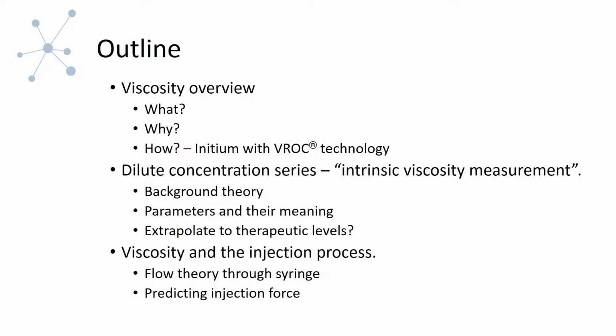viscosity and relate it to the injection process. So how can you predict injectability using viscosity measurements? We'll talk a little bit about the fluid mechanical theory behind flow through the syringe, and how we can then develop some relations to predict the injection force using viscosity values and known properties of the syringe and things of that nature.